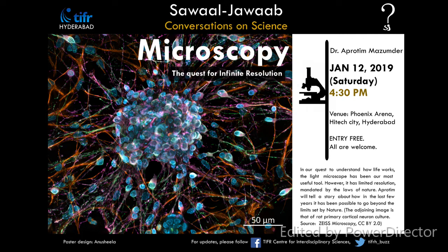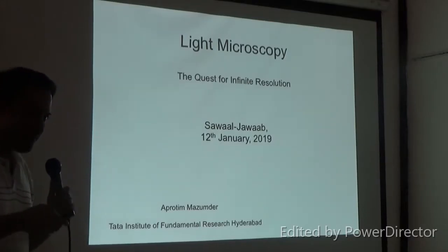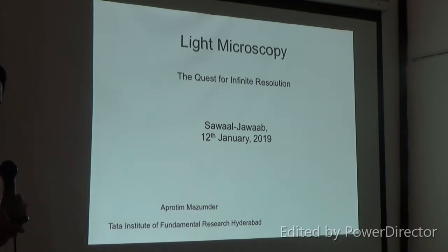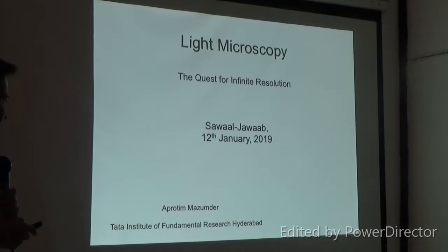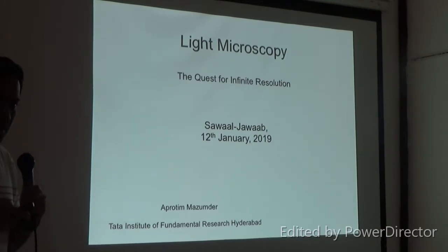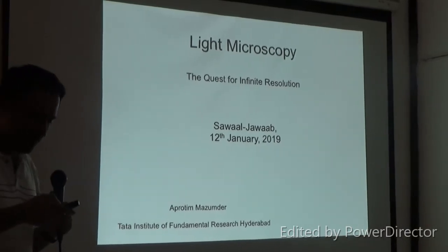We're going to specifically talk about light microscopy. There can be very many different kinds of microscopy, but today we'll focus primarily on light microscopy because that's by far the most standard kind. When you say microscopy, that's what you're thinking of. And how people have been pushing this technology further and further.